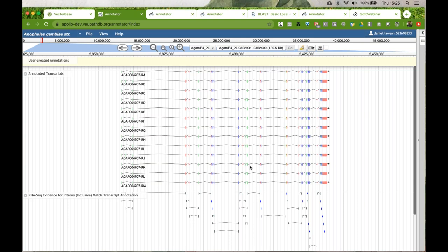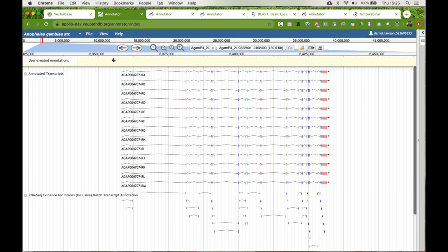The main things to note: there's navigation inside — drop-down menus at the top for configuring and moving around inside of JBrowse. There's a representation of the entirety of the contig you're currently looking at, with a little red marker showing which part you're viewing, and coordinate systems. This is a chromosome arm from Anopheles gambiae, about 45 megabases in size. You have move left, move right, zoom in and out on large or small scale, the ability to change which scaffold or contig you're looking at, and information about where you currently are.